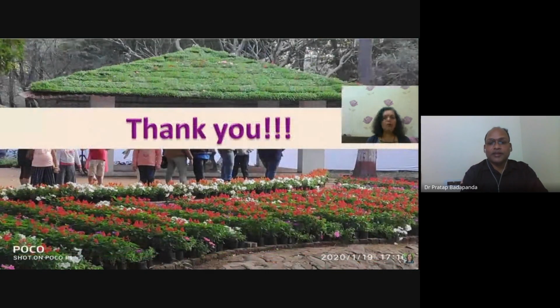Okay, thank you. I hope you all have understood the basic principle of thermometric titrations. How the method is carried out, how the process happens, how to calculate, all these things are described in this topic.